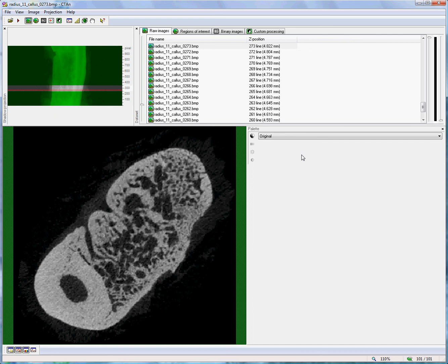Hello. The subject of this training video is the shrink wrap function. The shrink wrap function automatically wraps the region of interest boundary around the periphery of an object.